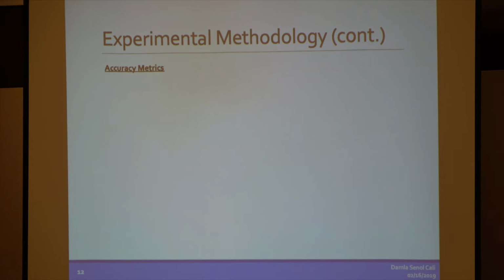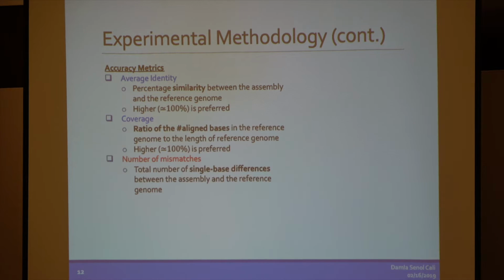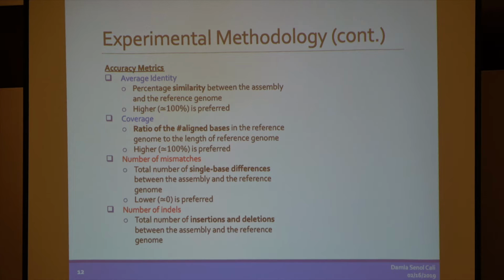And while performing our analysis, we set our accuracy metrics as average identity, coverage, number of mismatches, and number of indels.